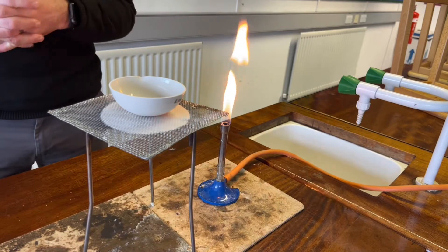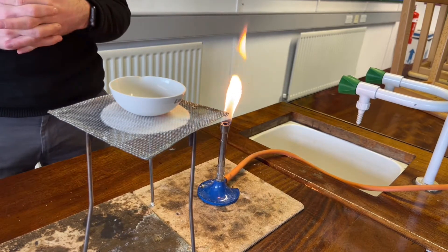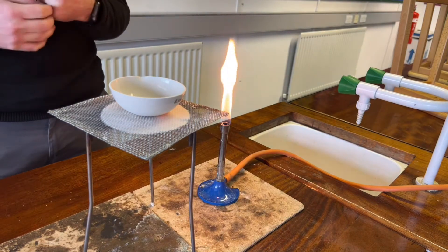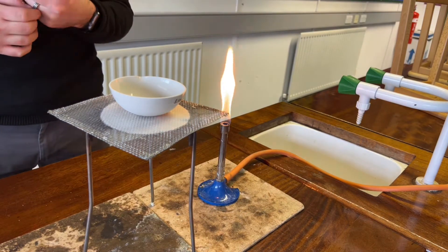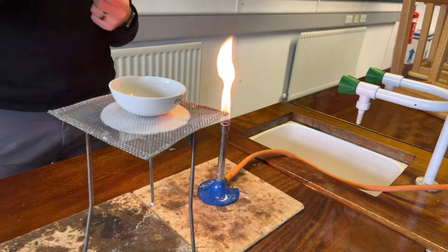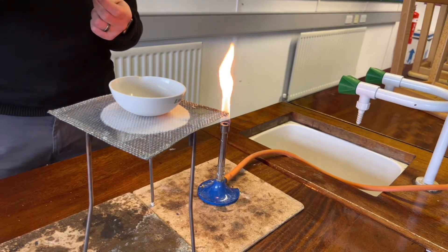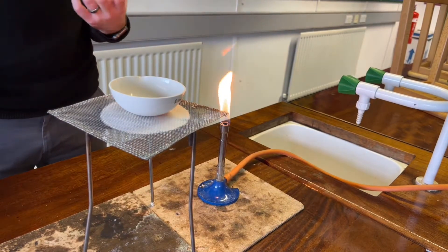Evaporation is a separating method and it is used to separate a soluble solid from a solvent. The soluble solid that we have here is sodium chloride, which is the salt that would have passed through the filter paper, through the filter funnel, and has been collected here as the filtrate.